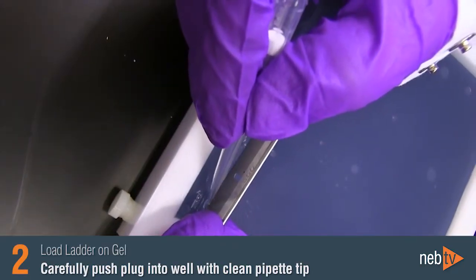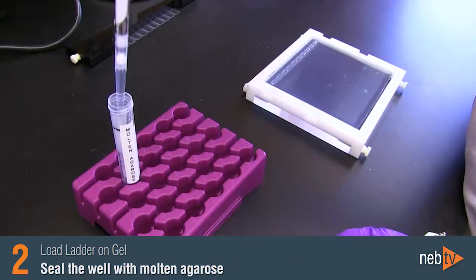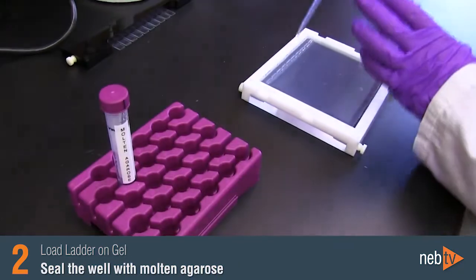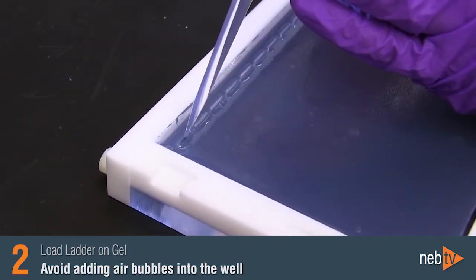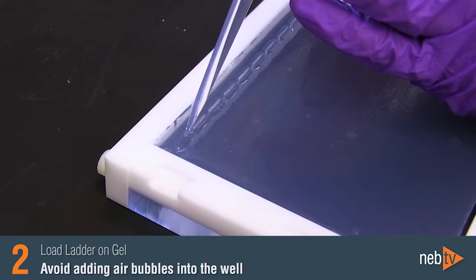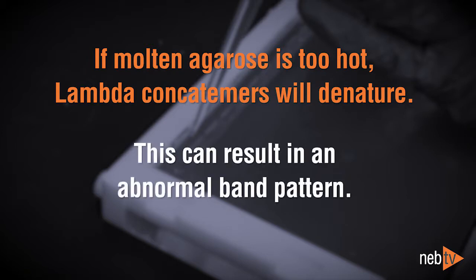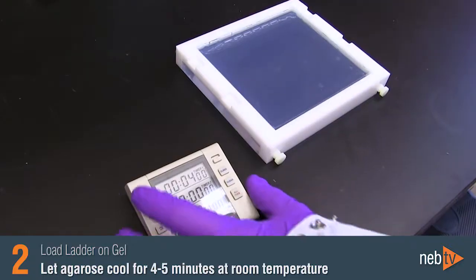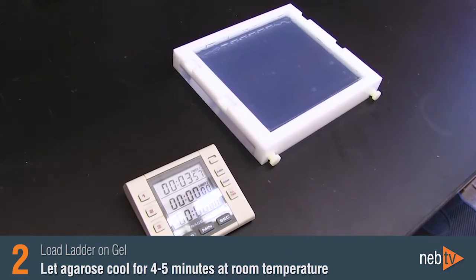Place the plug at the front of the well by carefully pushing it with the clean pipette tip. Then seal the well with the molten agarose, which is now just above gelling temperature. Be careful to avoid introducing air bubbles in the wells. If the molten agarose is too hot when you seal the wells, the heat will cause the lambda concatemers to denature, which can result in an abnormal band pattern, so it is important to cool down the molten agarose before sealing. After sealing the wells, let the agarose solidify for about 5 minutes at room temperature.